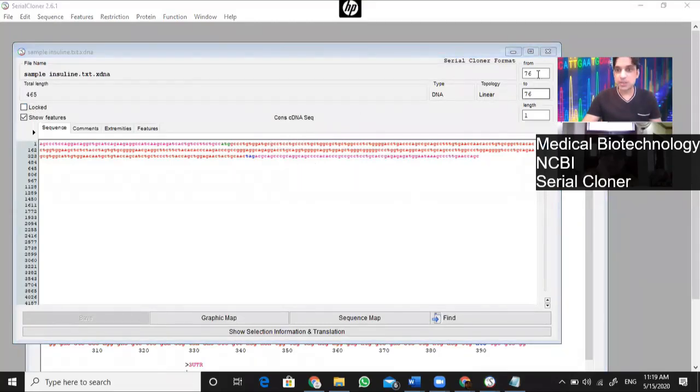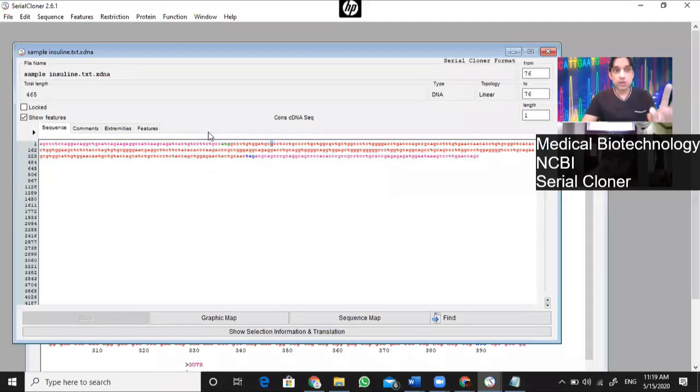And the place of your choice is the 76 base pair G, which is highlighted. You know the file name. The file name is sampleinsulin.txt. I am going to delete that base. You can delete it simply using the backspace. Good enough. Okay, backspace. Now the G is gone.